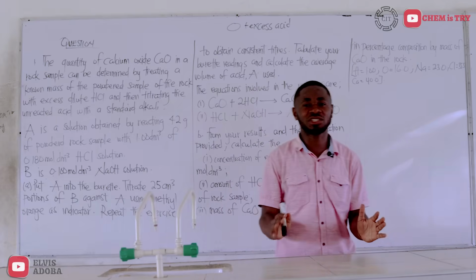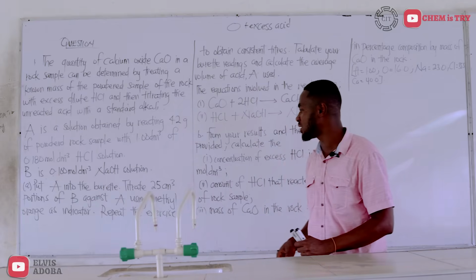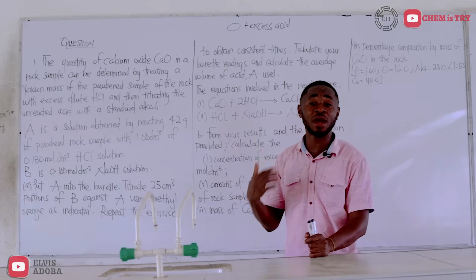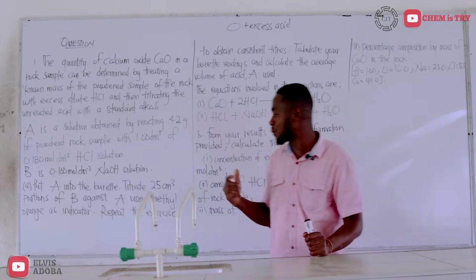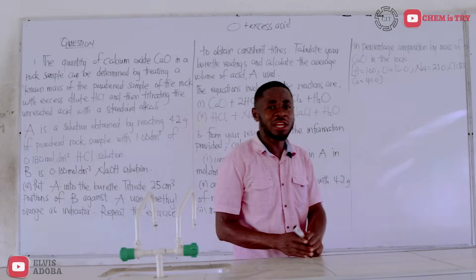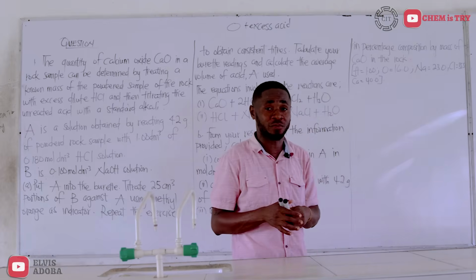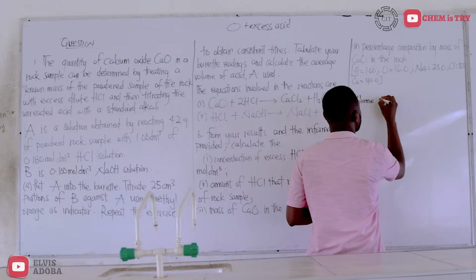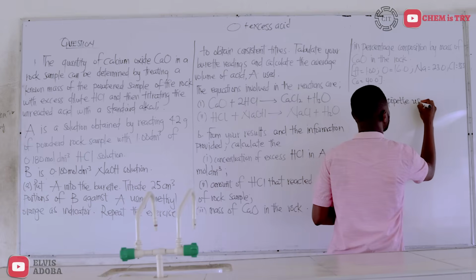Okay, in some questions, they will ask you to perform the titration using either 20 centimeters cube or 25 centimeter cube pipettes to take portions of B. In such instances, you need to state the volume of the pipette you personally made use of. So in such cases, you write volume of pipette used.